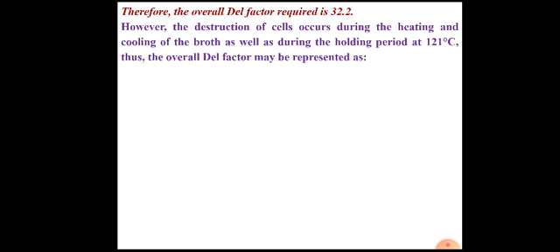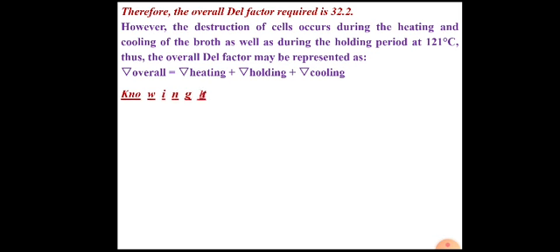Therefore, we need to calculate Del factor during the heating up period and Del factor during the cooling down period. So the overall Del factor will be represented as Del heating plus Del cooling plus Del holding. That will be Del overall.